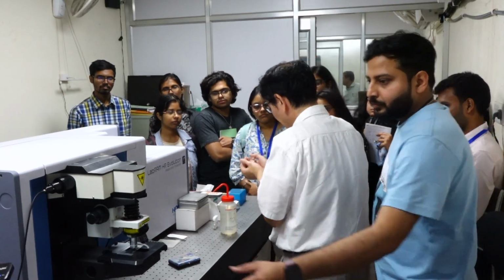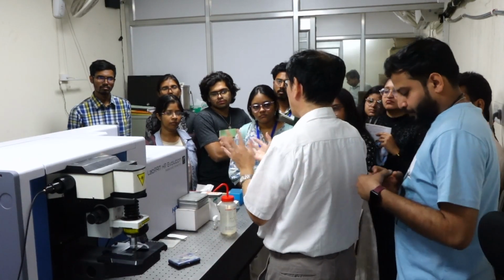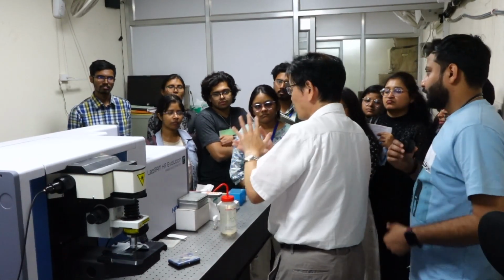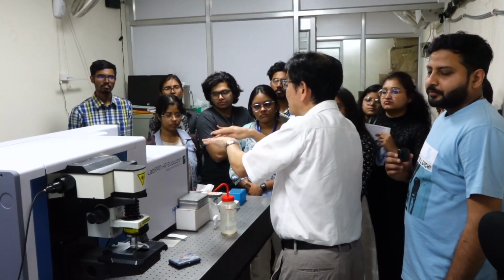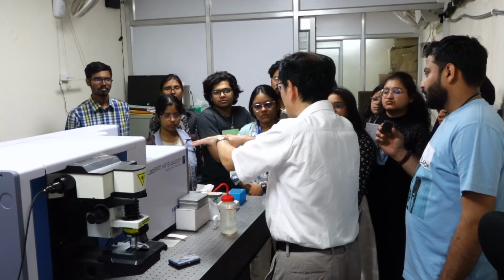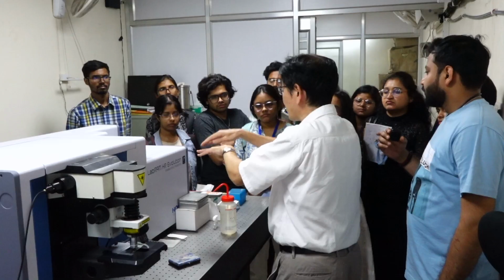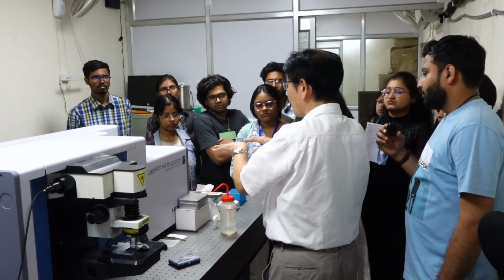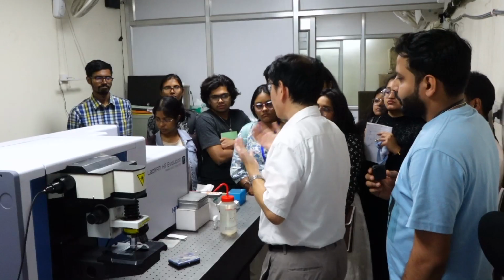When the signal is generated, there are many colors. So the monochromator separates that light into each color depending on the wavelength. It does not invert. Always in the same order from short to long wavelength. So everything is in this box.